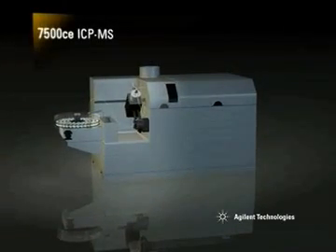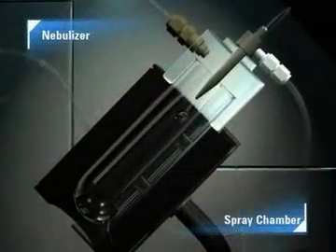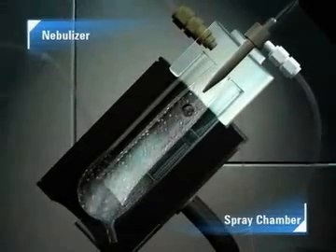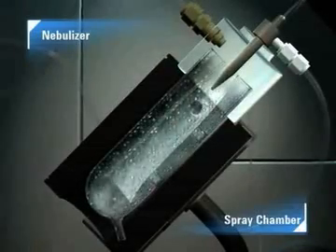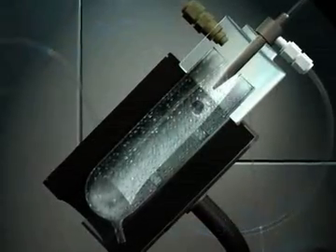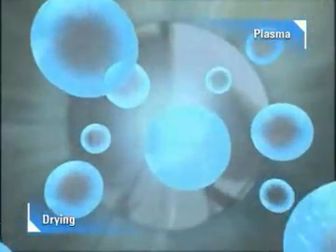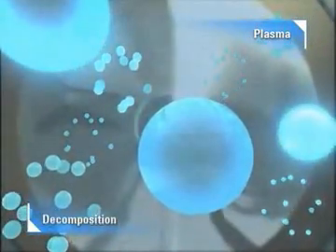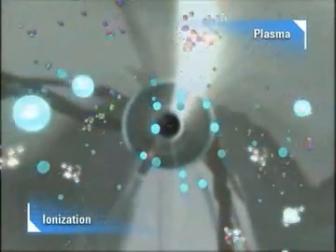Let's follow the journey a sample takes from its sample vial through the ICP-MS to the detector. Sample is pumped from the sample vial into the nebulizer, where it is mixed with argon gas to form an aerosol. Larger droplets are removed from the sample aerosol as it passes through the cooled spray chamber, and the fine aerosol is swept into the central channel of the plasma. As they travel through the high-temperature argon plasma, the aerosol droplets are dried, decomposed, atomized, and finally ionized, producing a rich source of positively charged ions.